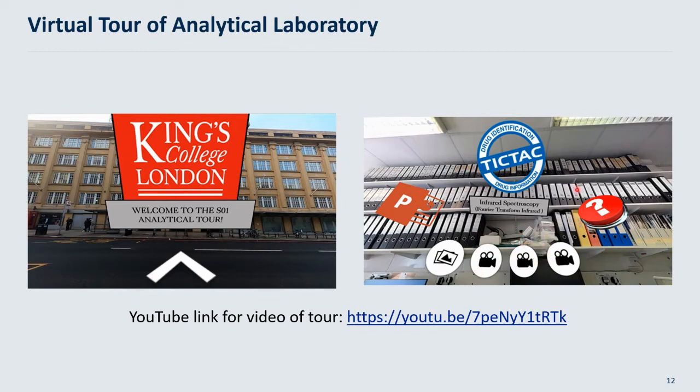And then this here is part of the e-learning, which can be integrated into the virtual learning environment, and that specific e-learning is looking at the comparisons of infrared spectra to a standard. What they're able to do is look at the spectra and make direct comparisons within the virtual tour, which is quite helpful, because a lot of the issues where we try to mirror them, we couldn't actually do that and make notes, but that allowed us to get a direct comparison.